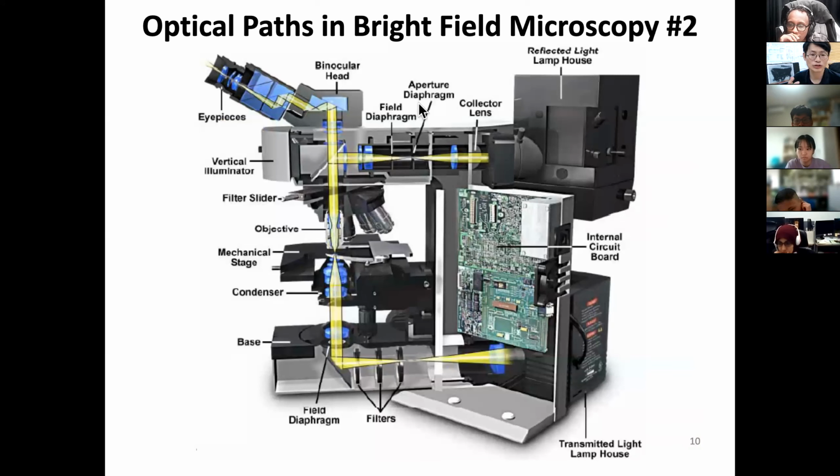Okay, now let's move on to a more modern optical microscope, which is more sophisticated. You can see a lot of electronics involved. However, the basic concept is pretty much similar to what you have already. This transmitted light is making transmission illumination of the image, but a modern microscope also typically has fluorescence capability.